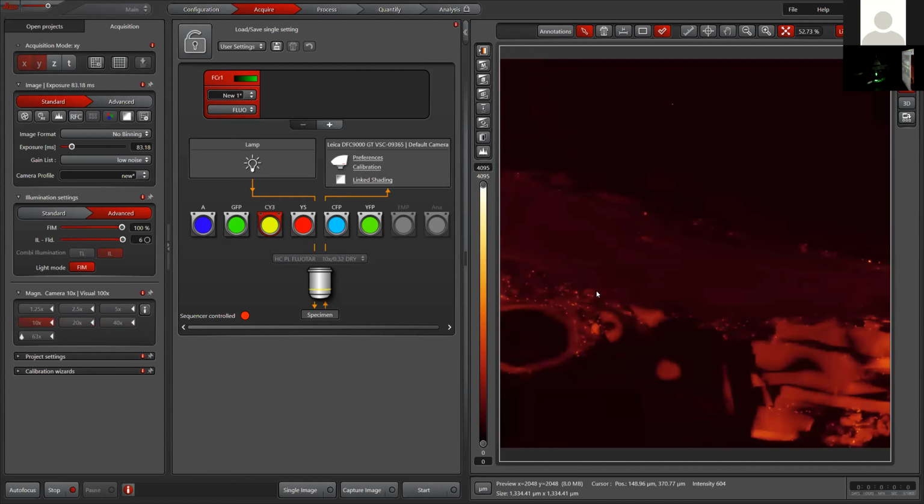All right. Yeah, that is a little dimmer because it has lower NA. But I think it shows still okay.